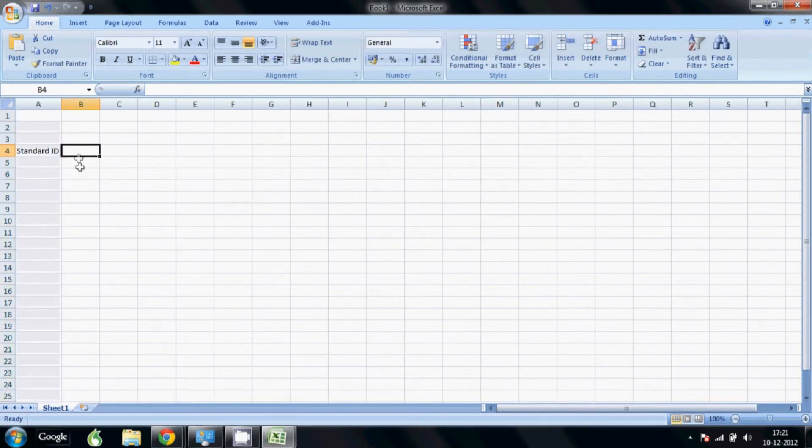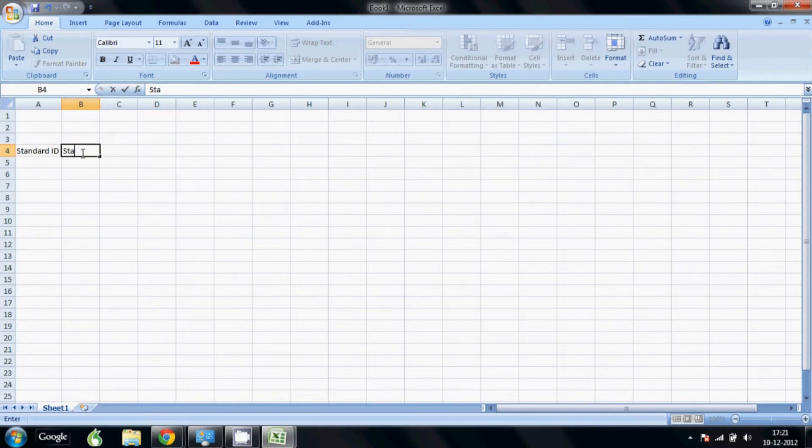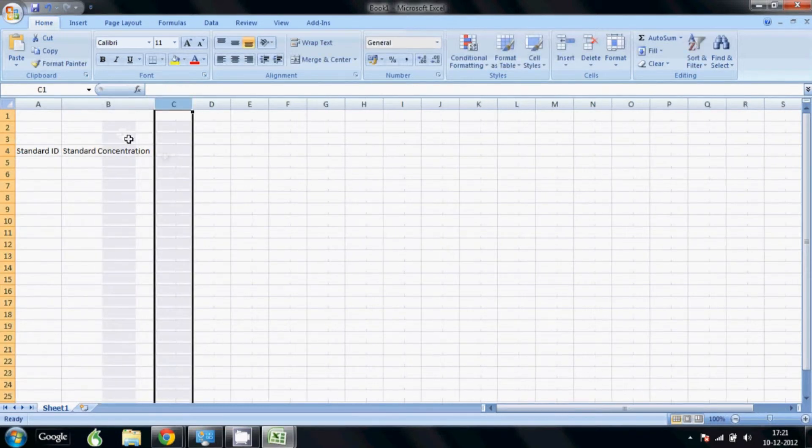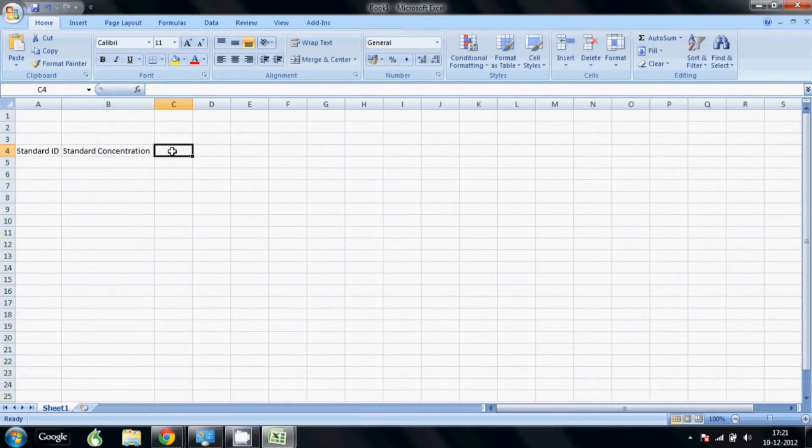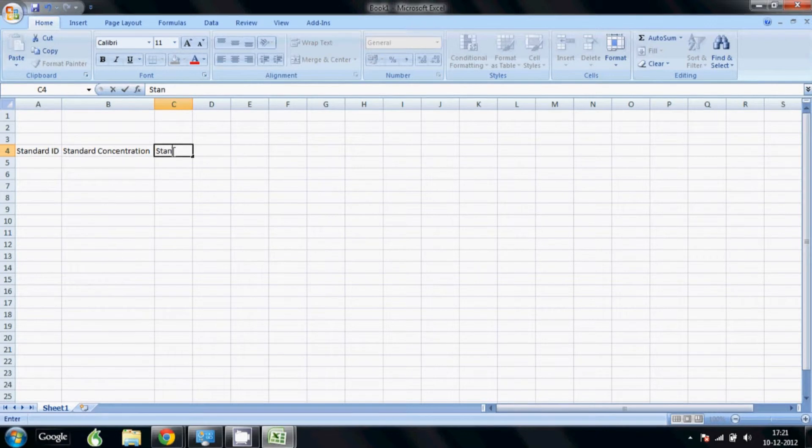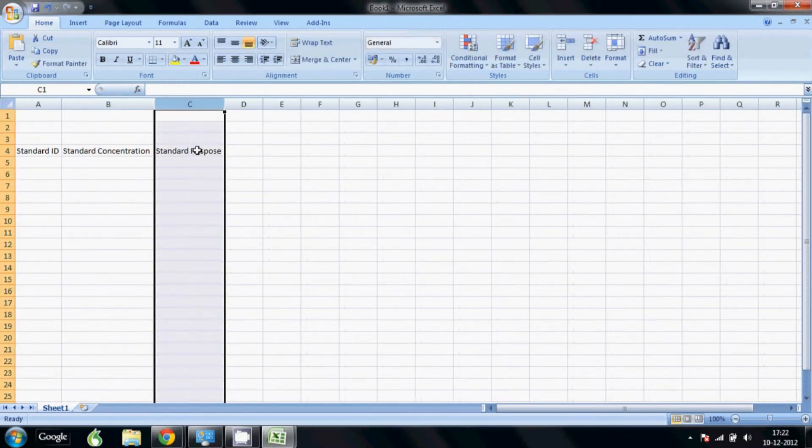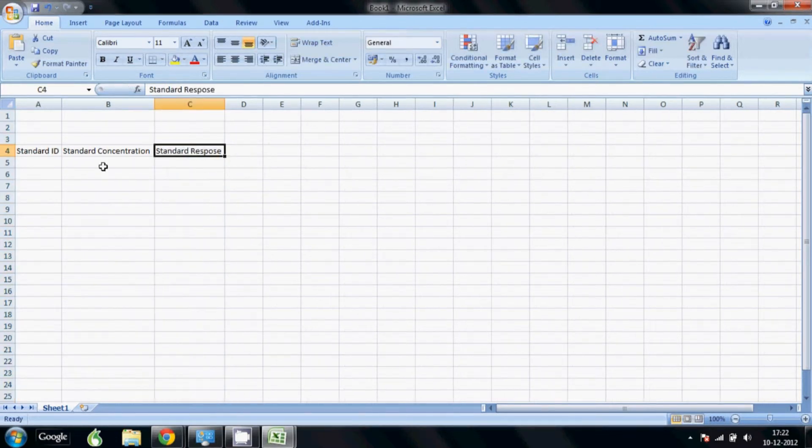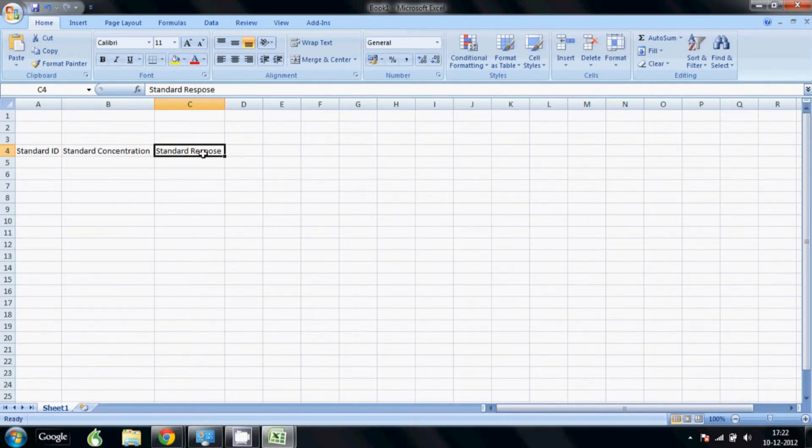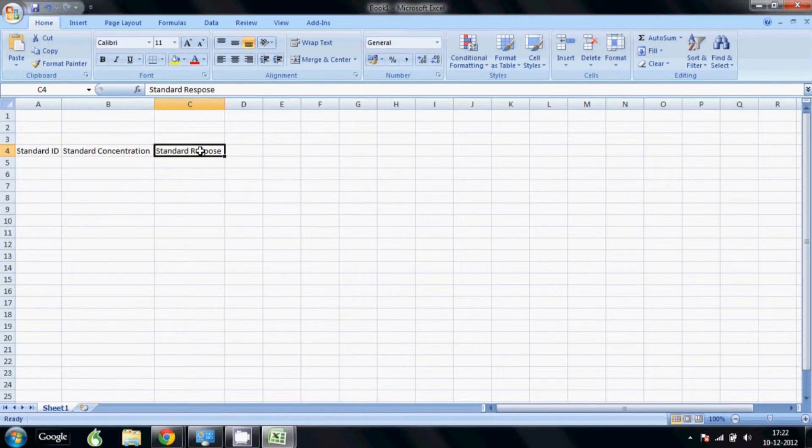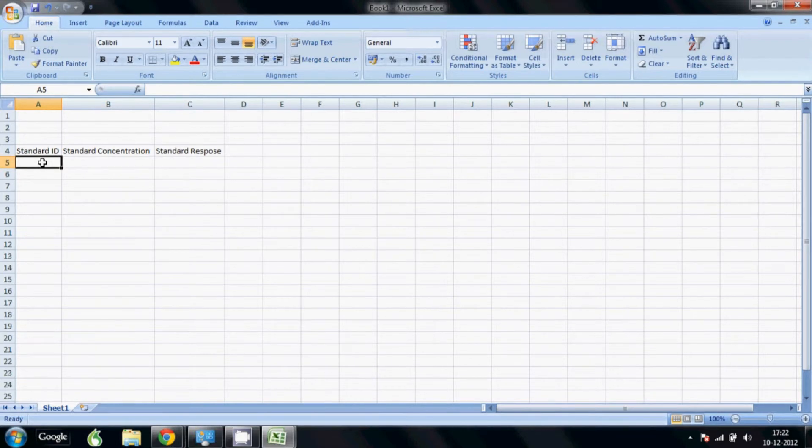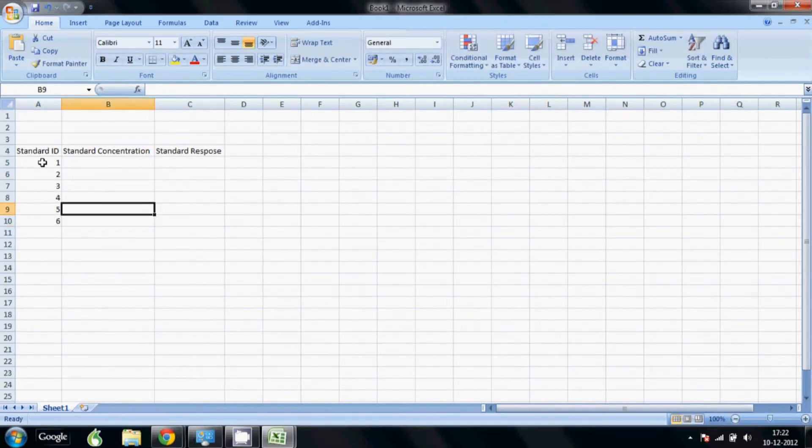Then the concentration, then your response for the standard. Here you can actually use any technique. You can enter data from a UV spectrometer or any HPLC or atomic absorption. That's why you're seeing response. In case of UV you will have the absorbance, or in HPLC you will have the area or height of the peak. So anything can be used. Usually we have six standards which is the recommended minimum for most regulations.